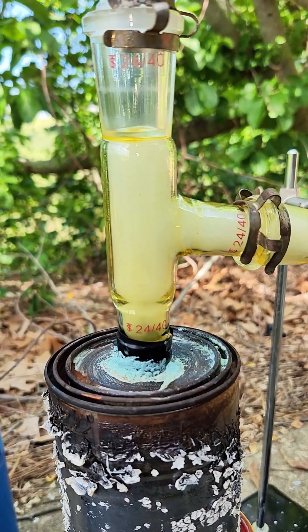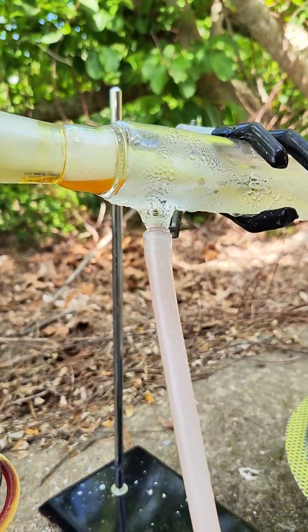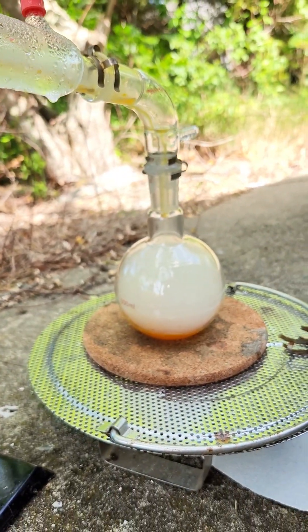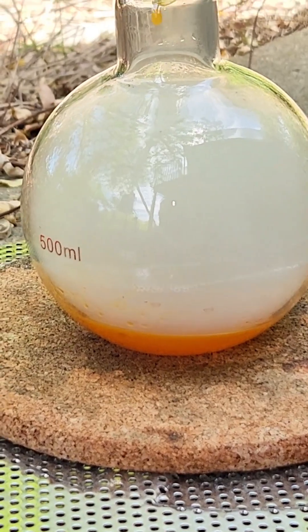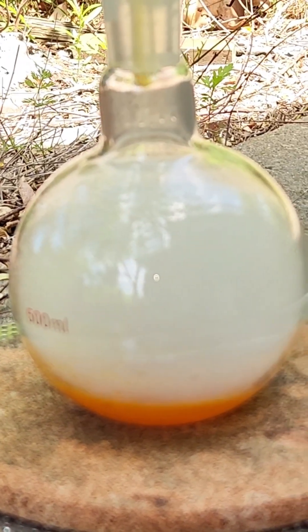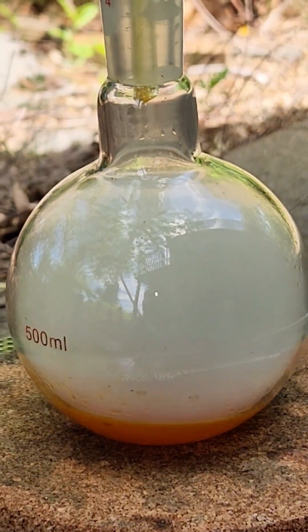as the reaction heats up, the sodium benzoate and sodium hydroxide react to form sodium carbonate and free benzene. The benzene distills over as this yellow liquid along with a lot of water vapor that was present in the reactants.